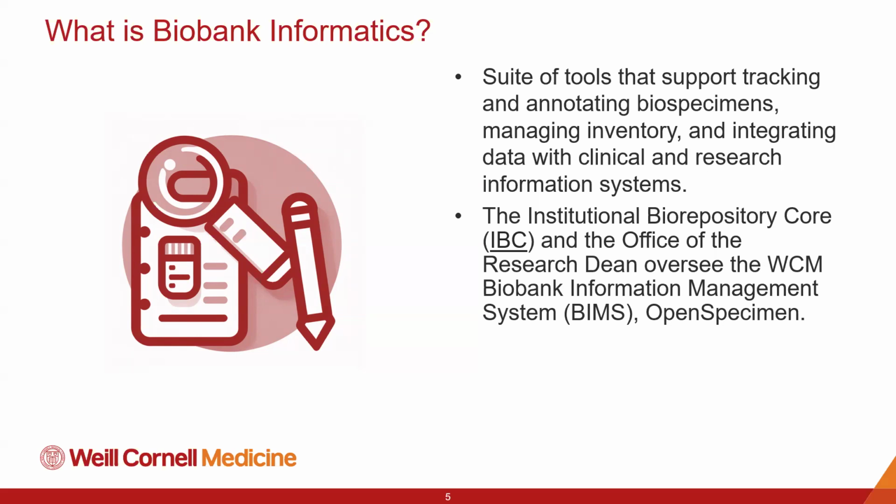We also take that information, or that record of the biospecimen itself, and integrate it with potential clinical data. All of that combined can then be used to promote research and aid in the analysis of individual specimens. So when we think about how we track all of this information, we leverage what we call a biobank information management system, or a BIMS.